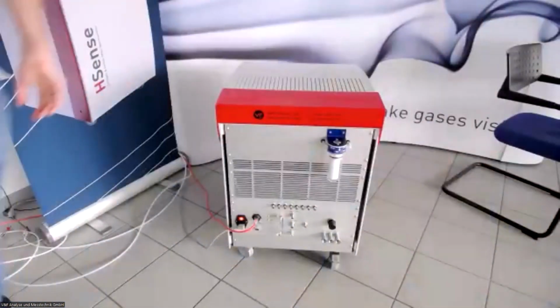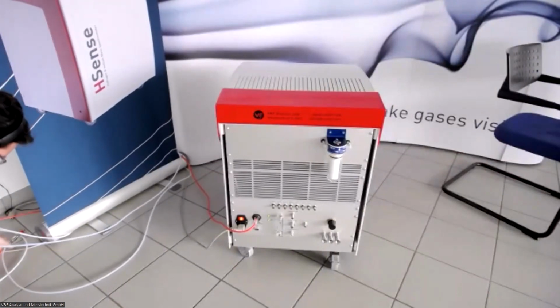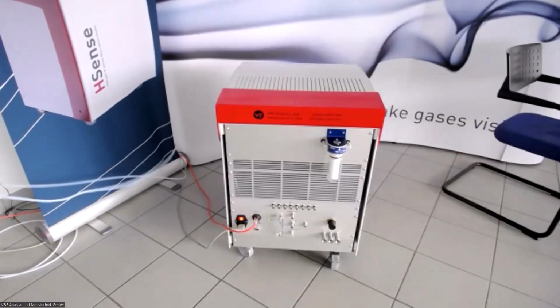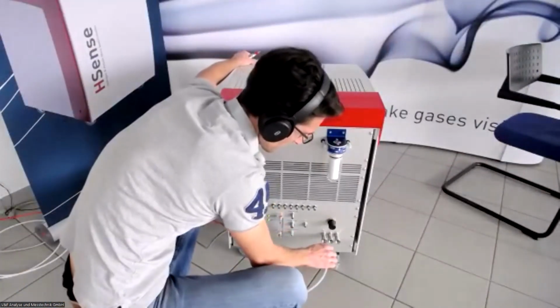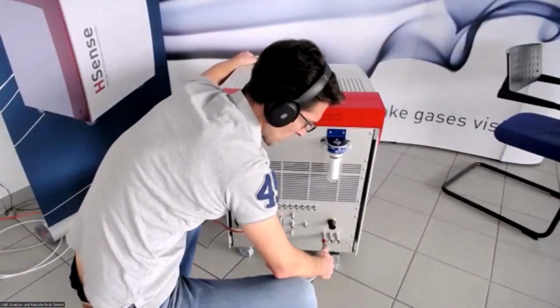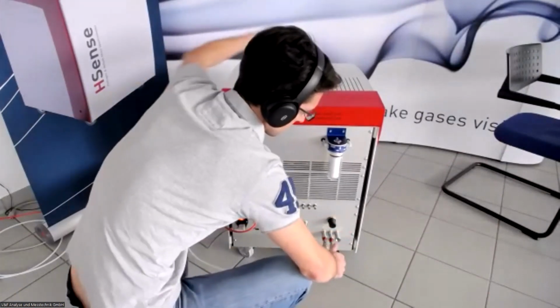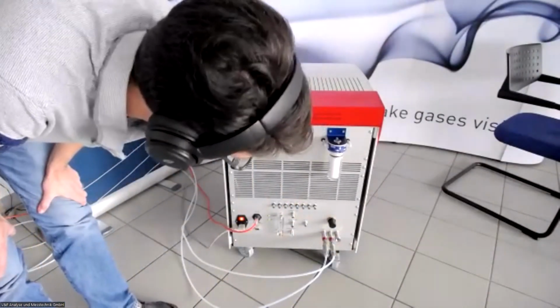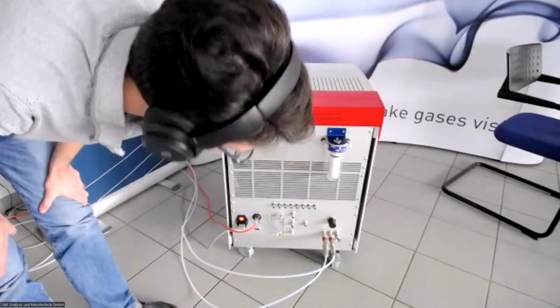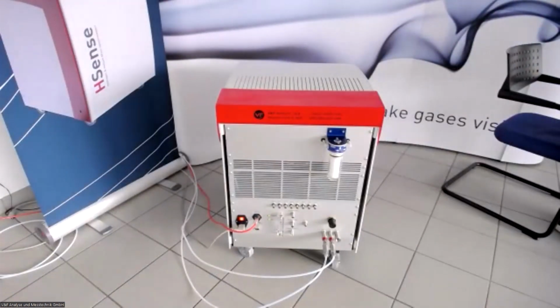So what we're going to do first is connect two gases to the calibration gas inlets. This is a quick connection system, so you just put it in and it will interlock by itself, like this. Now we have connected nitrogen to inert and a 1% hydrogen calibration gas onto the Cal1.